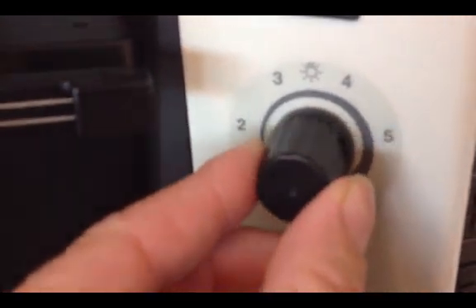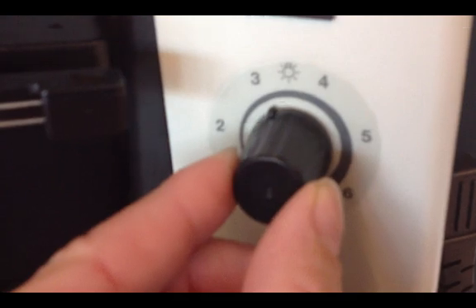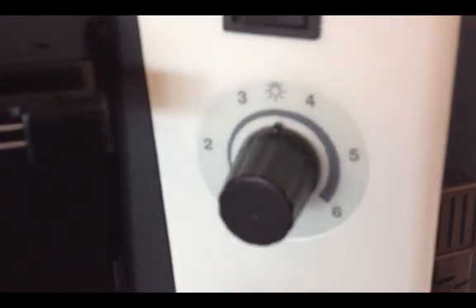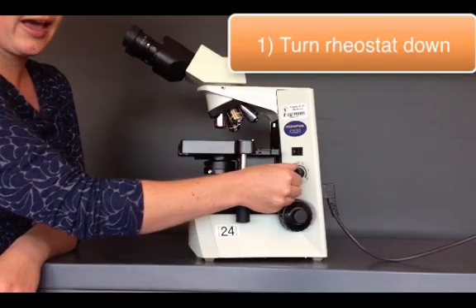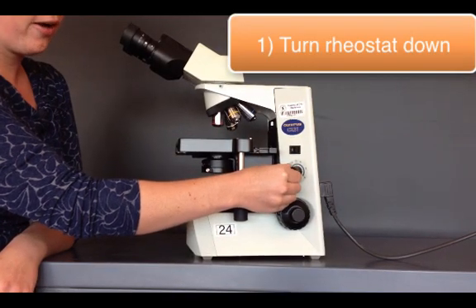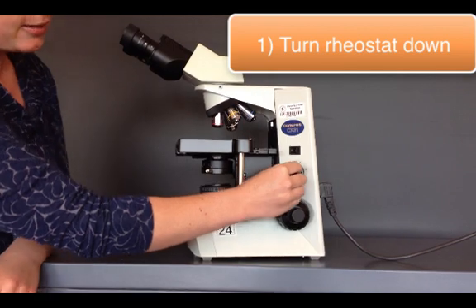If the rheostat is turned all the way up and then you turn on the microscope, it could burn out the bulb. So the first thing you do is make sure the rheostat is turned all the way down to the lowest setting. In this case, 1.